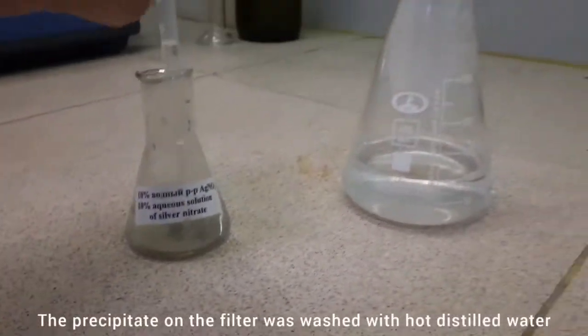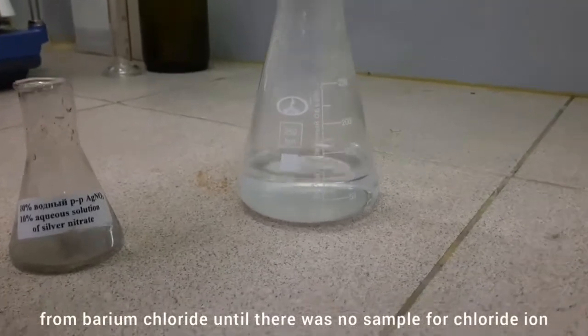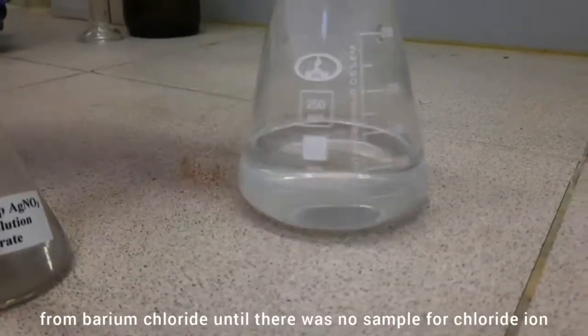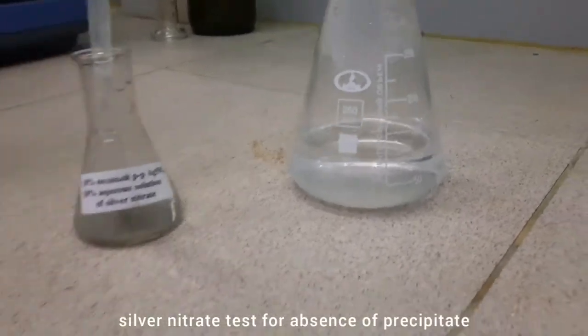The precipitate on the filter was washed with hot distilled water from barium chloride until there was no sample for chloride ion. Silver nitrate showed absence of precipitate.